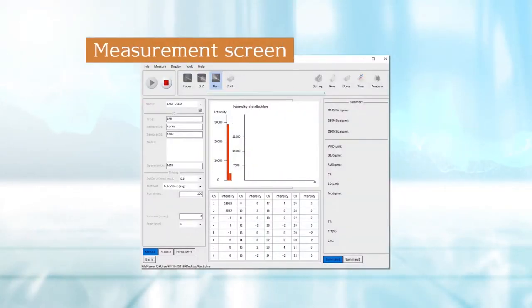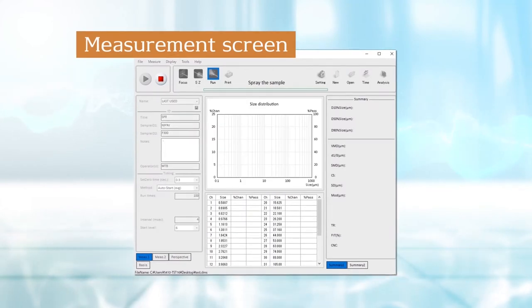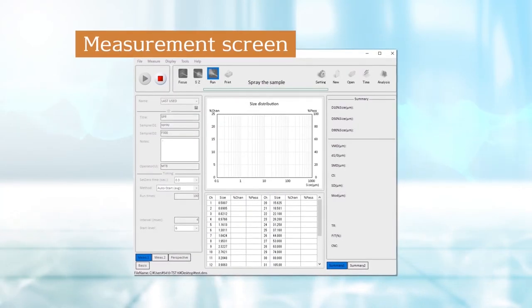Measurement using Aerotrack 2 is very easy. Automatic alignment of lasers is performed with one click.